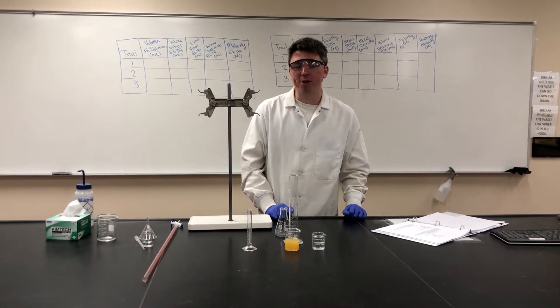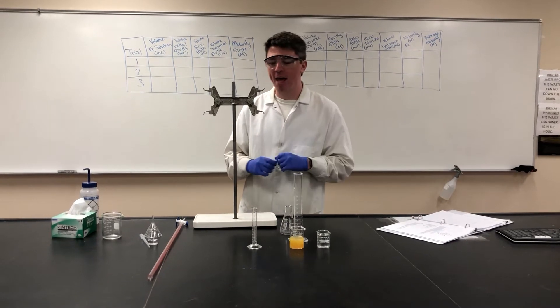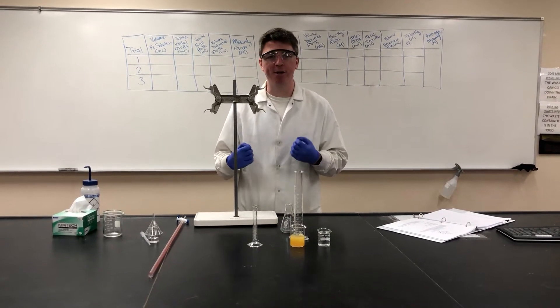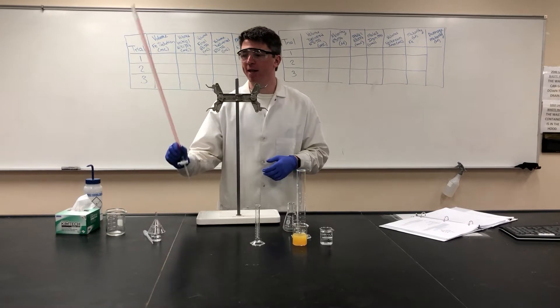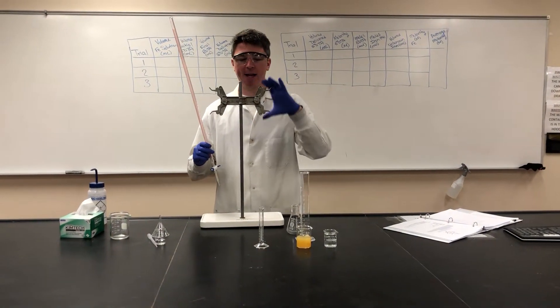Today we're doing an experiment to look at the phenomenon of metal chelation using a technique called titration. To set up our titration apparatus we will need a burette, a ring stand, and a clamp.